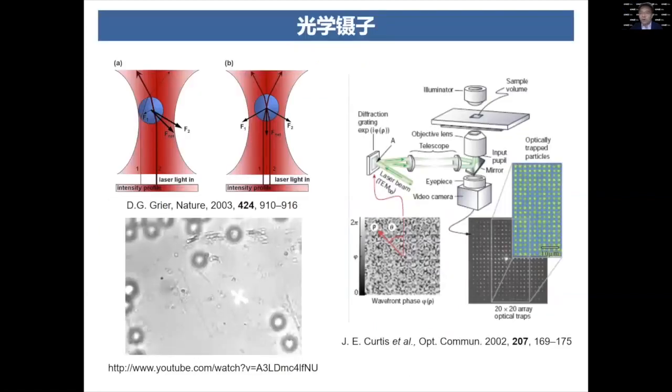Sometimes we call our technology acoustofluidics. Sometimes we also call our work acoustic tweezers. We get the name acoustic tweezers from optical tweezers. Optical tweezers has been a very, very powerful tool, and it has impacted so many researchers in the last 40 years. It can precisely manipulate particles or biological cells.